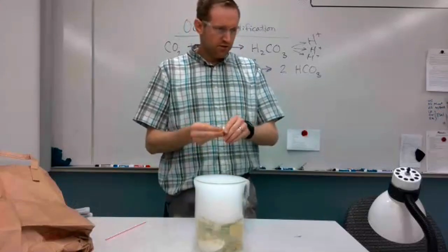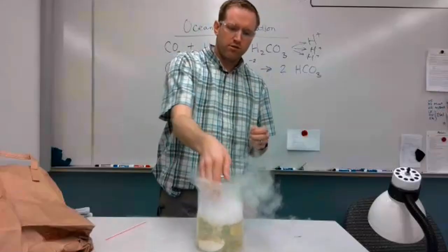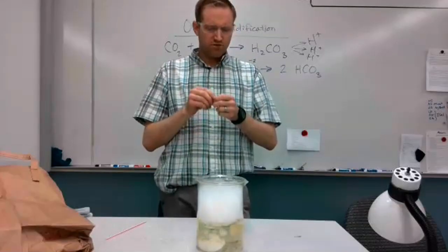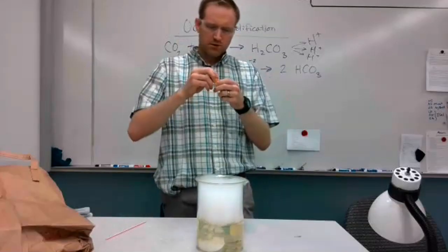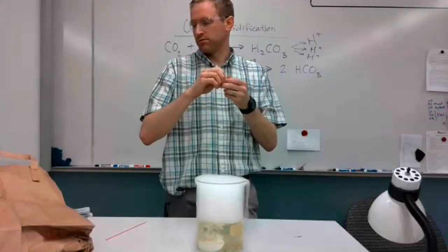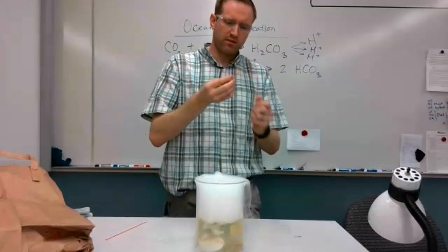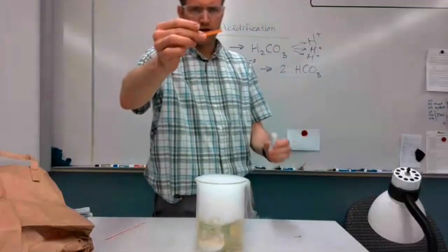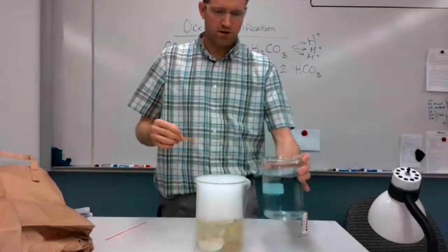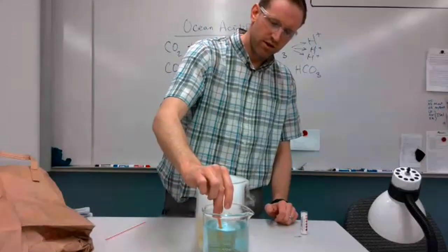All right, just for fun, I'm going to play with that a little more. Come grab some dry ice from me if you want to play. Well, assuming it's still there, it kind of disappears after a while. Okay, I'm just going to take some pH paper here. This is the orange stuff you guys played with. Let's take the pH first of our pre-industrial revolution ocean here.